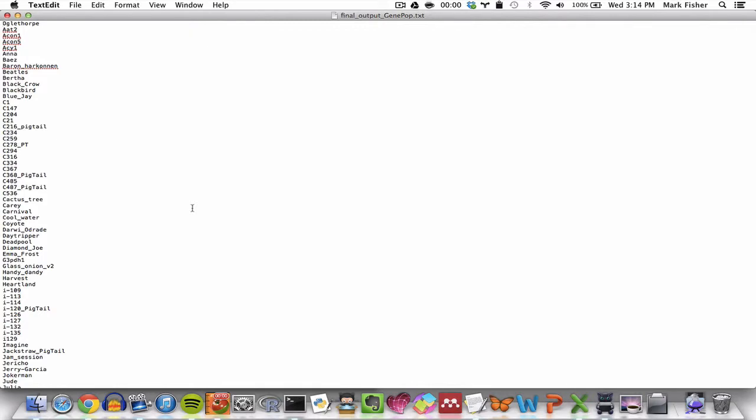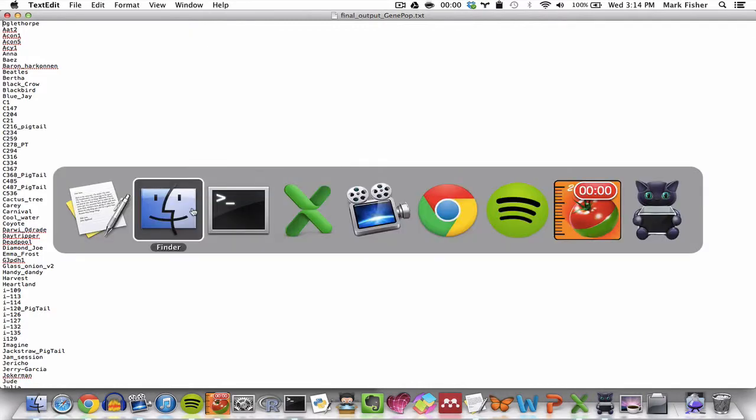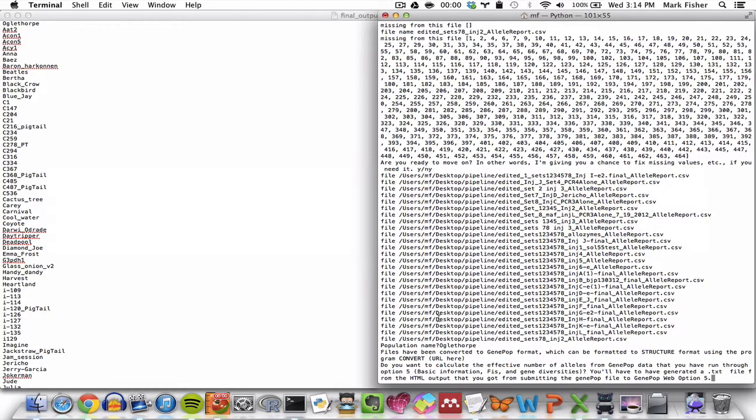Okay. And at this point, the pipeline asks you whether you want to calculate effective number of alleles with the help of GenePop. And if you do, you type Y or yes. So, yes.